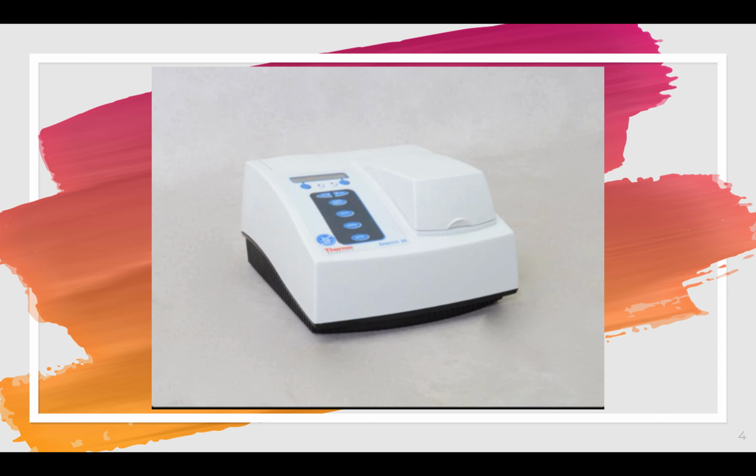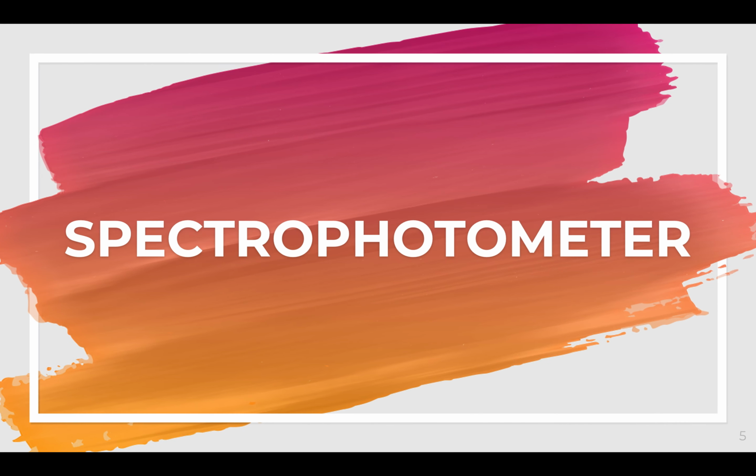So what we have now is your spectrophotometer, and your spectrophotometer is actually an example of an optical instrument. When I say optical instrument, it is used to measure your light.